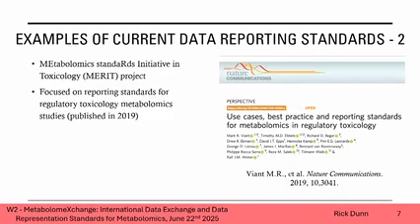So coming along more recently, and I'm going in order of date when these were released. Mark Viant, an ex-colleague of mine at the University of Birmingham in the UK, with a group, thinking more about, from the MERIT project, regulatory toxicology and how metabolomics could be used within that. Other omics have had similar best practice and reporting standards as well. So this was very much focused on one application area. The MSI standards were across all applications. This is in one application area, and it's definitely worth a read.